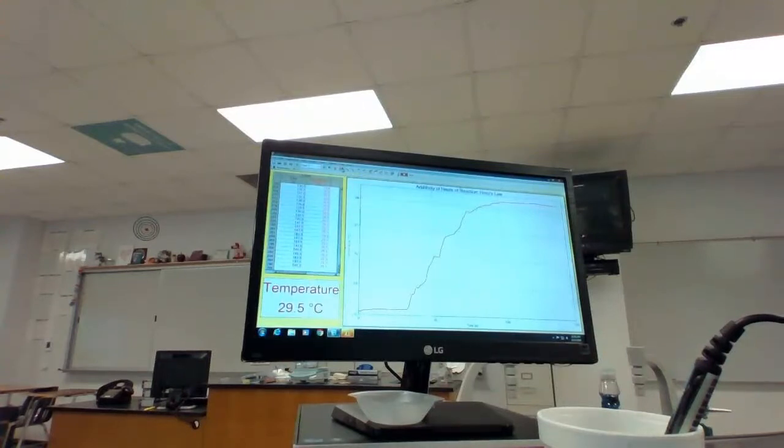Okay, letting it go there for just a little bit so you can see what is going on. And this is a typical heating curve that you might see for a spontaneous reaction like this. I only stirred it to make sure that we would get an even distribution of particles throughout the solution. And so I think we're kind of right there as far as how far this reaction goes. So I'm going to go ahead and stop my reaction.